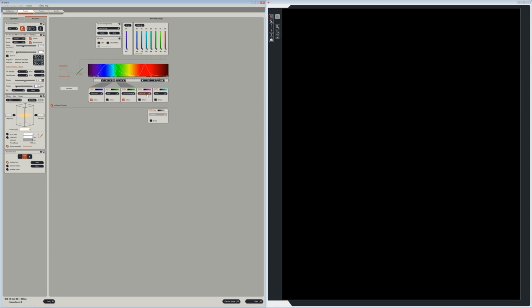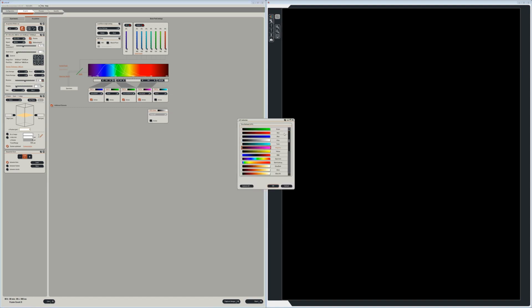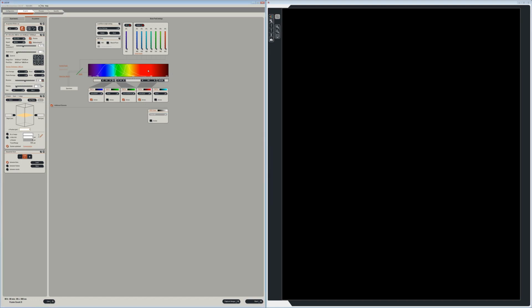Then for my next one, let's say I have Cy3. So I'm going to come here, and I'm going to go Cy3. I'm going to activate that as well. I'm going to change the color to red, and I'm going to move this under the curve. So you want your detector to be under the curve, capturing as much as possible from that emission.